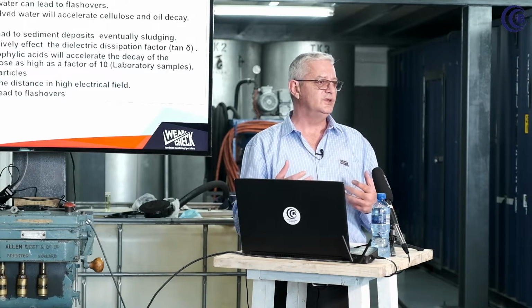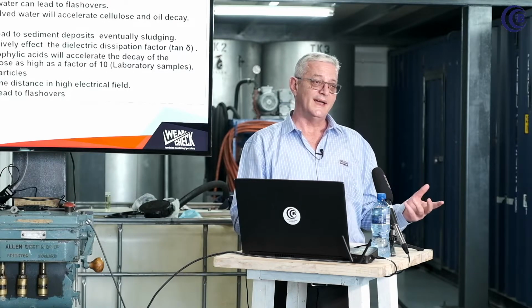Now the different acids, and that's your TAN that we were talking about, your total acid number. That forms sludge later in your transformer, and that goes into your core. It will influence your cooling, it will break down your paper much faster. So acid or TAN is the next one that you want to look at and keep as low as possible to extend the lifespan again, not only of your oil, but of your transformers.